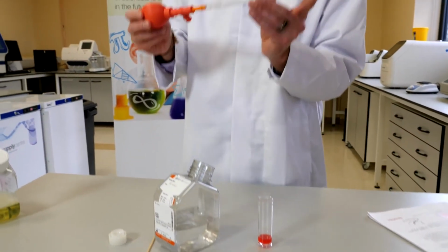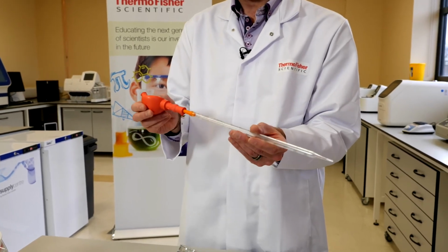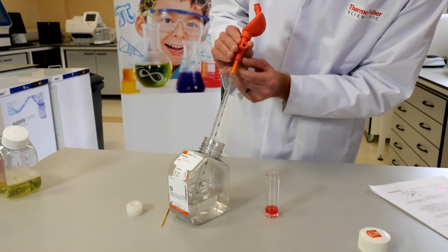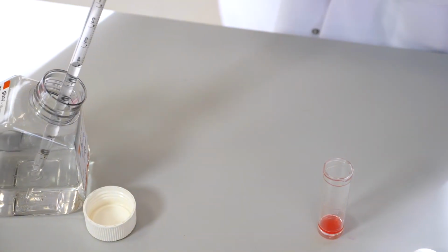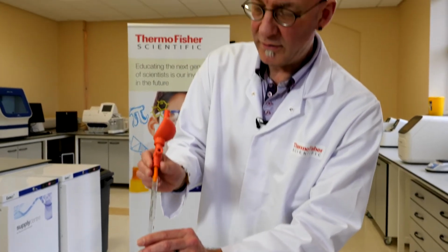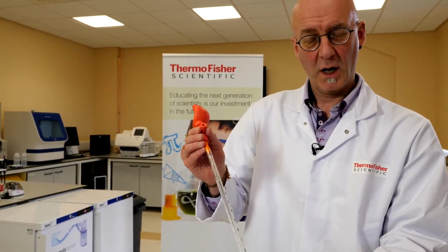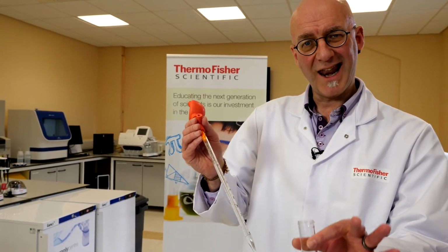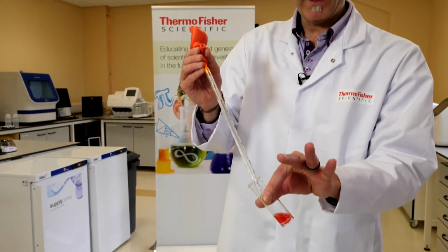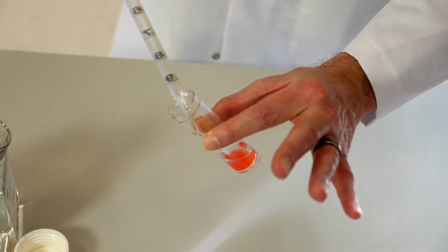Again, take the pipette, use a different one this time because we don't want to contaminate the alcohol with the solution that we used earlier on. But we're going to do exactly the same as we did before. I've already squeezed out the bulb. I'm going to press the second button and pull up about 10 milliliters. You don't have to be massively accurate with this. And then what we're going to do, very, very carefully, because I don't want these two solutions to mix, I want the ethanol to layer on top of the DNA solution with the strawberries in it. So I'm going to put that in there and run it down the side, pressing that button that releases the ethanol.